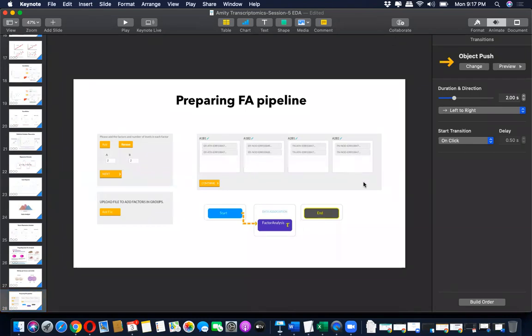Which one is the link for the file? The first one, the tiny URL. I'm going to paste it again then. This is the link to the file. It's a text file that you will download from this URL. You can save it as a text file, or even copy paste it in a text editor. You can just download it and it will be saved as a text file.